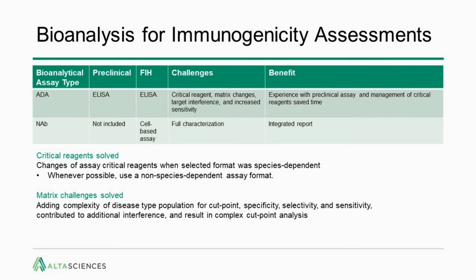I would like to further comment on the critical reagent issue that was solved. Changes of assay critical reagents when selecting format was species dependent. So whenever possible, use a non-species dependent assay format. Early discussions with the client in the preclinical section of the program minimized the assay format changes between preclinical to clinical studies.